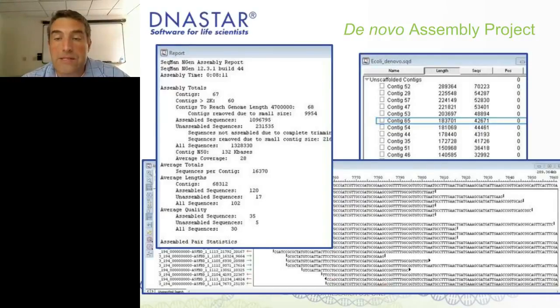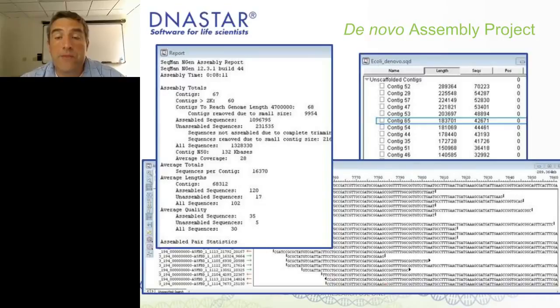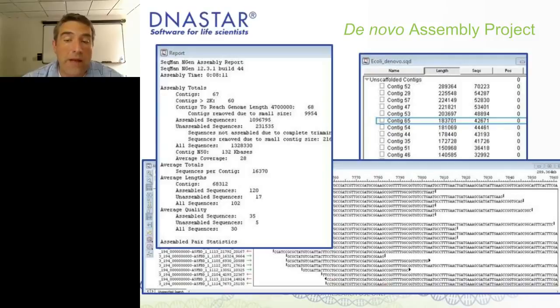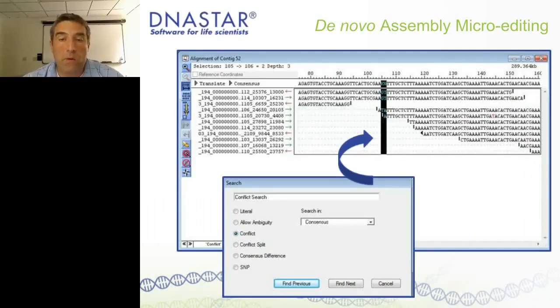We also get a contig list showing the summary — some contigs are well over 200,000 base pairs long and contain tens of thousands of sequences. This view is interactive with the alignment views. The bottom view is the aligned data, which is fully editable in this SeqMan project file. I can go in and do micro edits, edit the consensus, and edit individual sequences. It's a great tool for interacting with this assembled data.